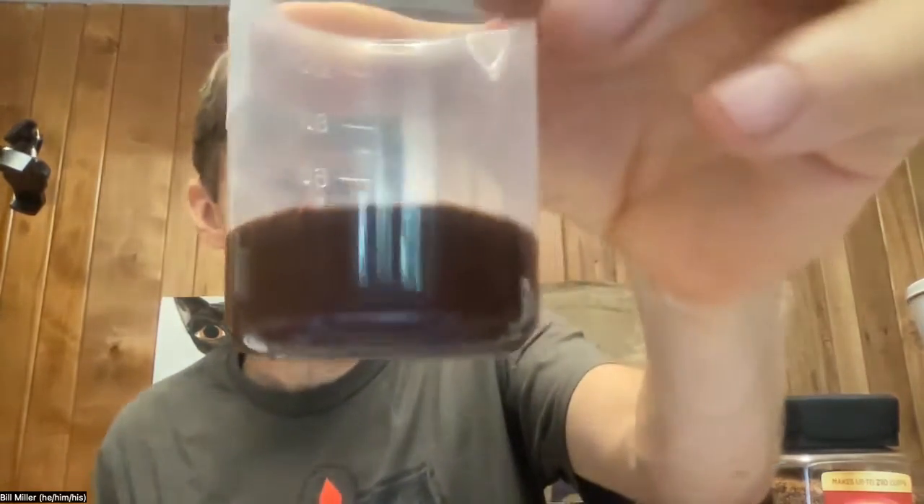I'm going to stir that with a clean, dry plastic spoon. It's important that the spoon is dry — clean is obvious — and dry because you don't want to add any more water. Before I make the next solution, I will rinse these off with soap and water and then dry them off.